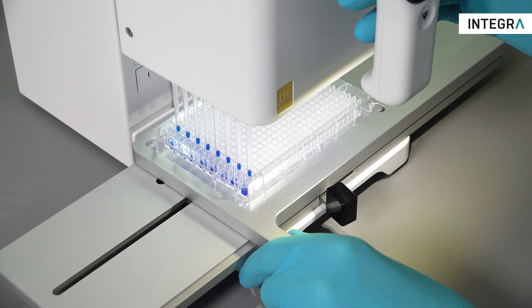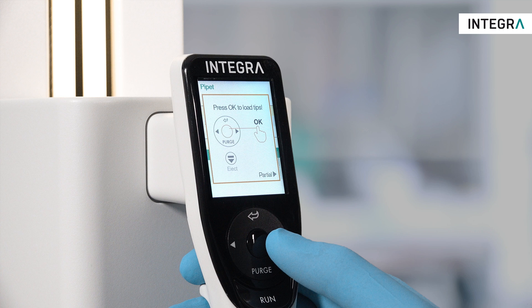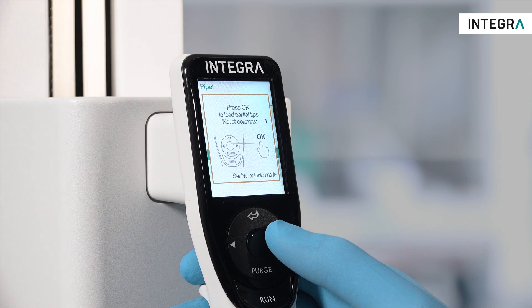To load partial tips, move the head until touching the desired number of tips and press partial to activate the partial tip loading screen when prompted.